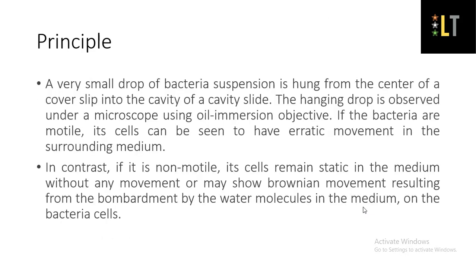Now we will see the principle behind this hanging drop technique. Usually what we do is we take a drop of bacterial suspension and put it on the center of the cover slip, and this cover slip is placed onto the cavity slide in such a way that the drop is not burst, and the slide is observed under the oil immersion objective lens.